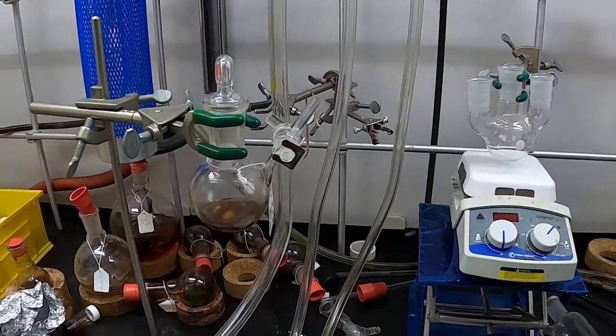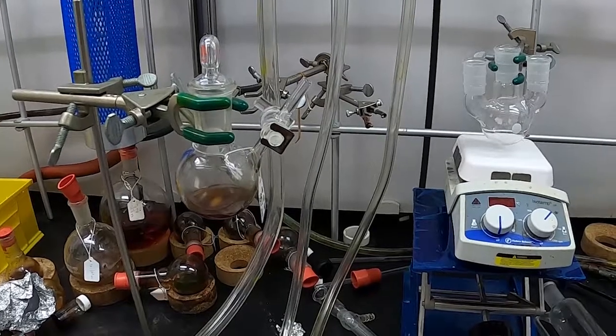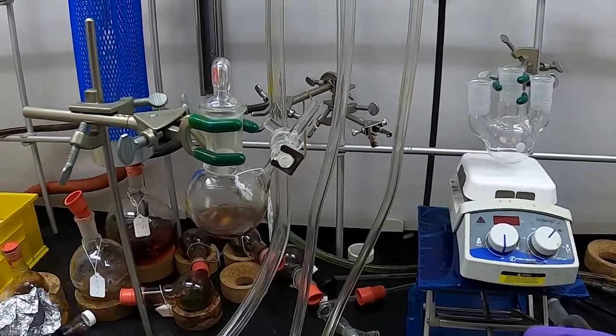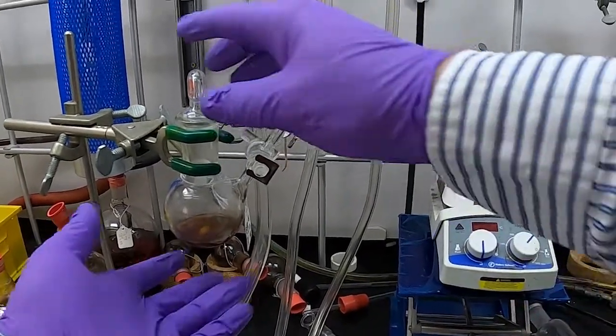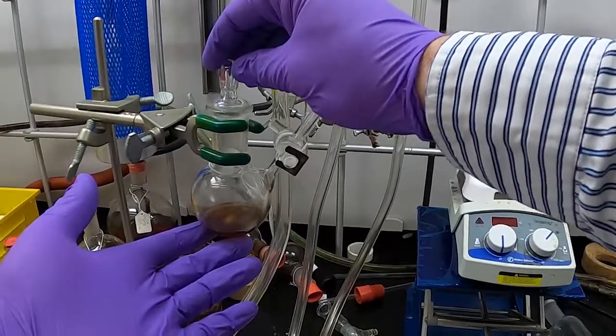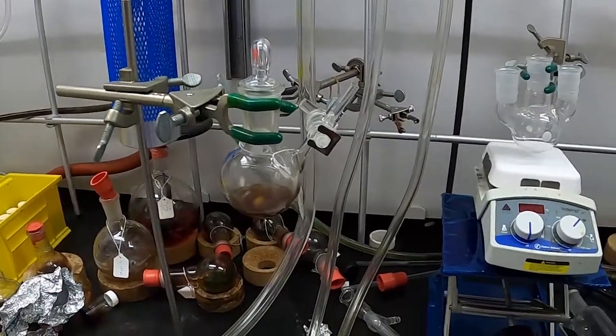All right, today's topic is working with Schlenk lines and trying to keep your ground glass joints together. As you can see, we have this Schlenk flask here with a glass stopper.